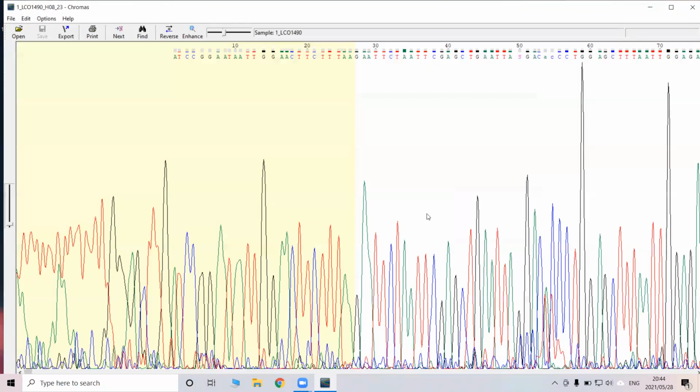the file of interest. So when we open ChroMass, we'll see 2 things in particular. First, which is most obvious, we will see a spectra. This spectra has many different peaks with different colors, and this is called a chromatogram.